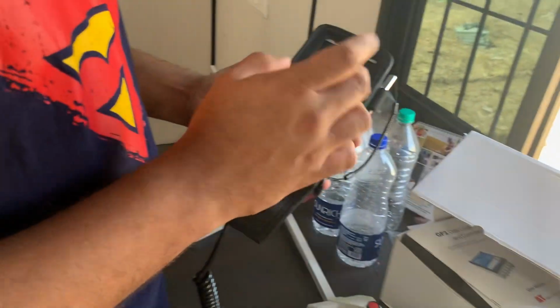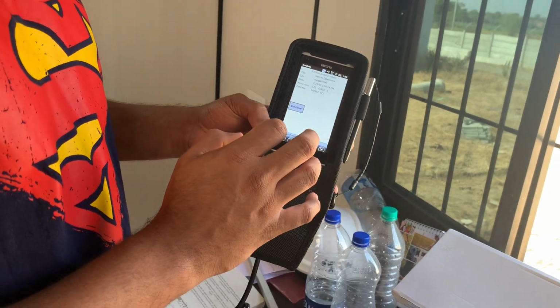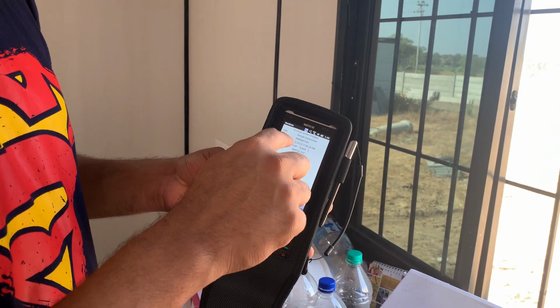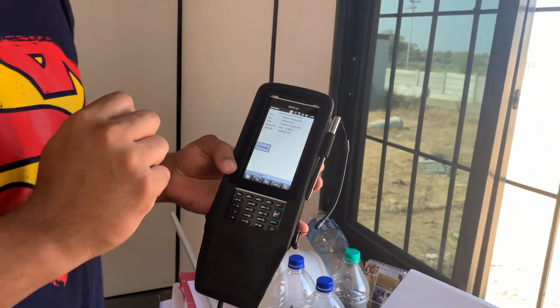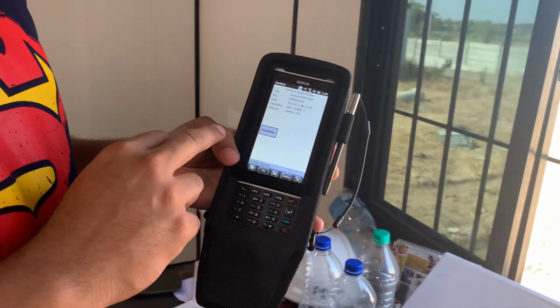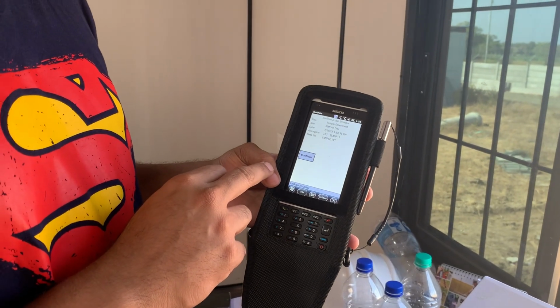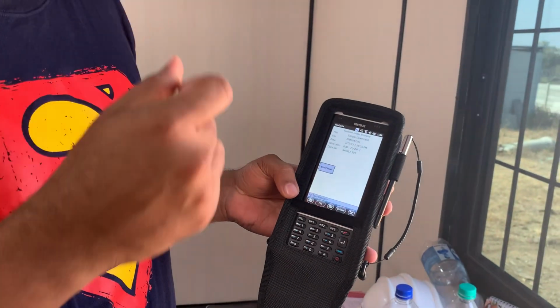Now the cable is connected to the PDA, and you can see this SunScan probe emulator listed with the title, the site. There is a catch here. We are on emulator mode. There are different modes. The emulator mode is just for training, where it is not actually getting any values. The actual data collecting mode is known as the COM2 mode.